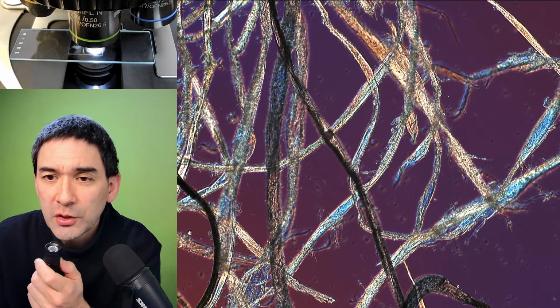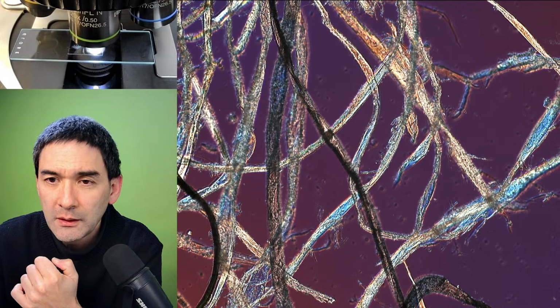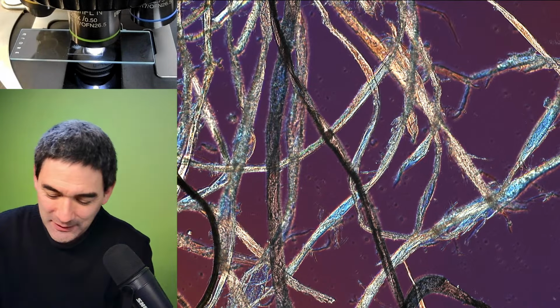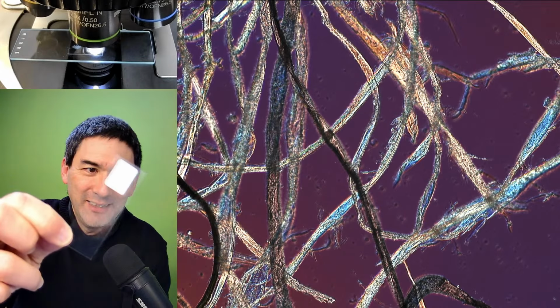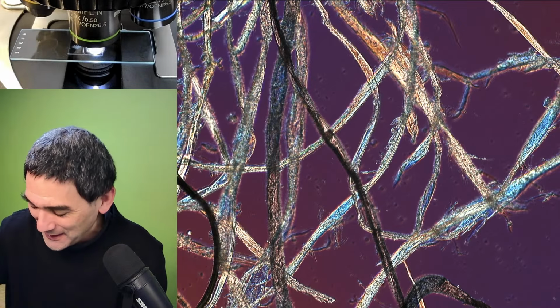There was a question about a microscope camera. Did we note what mounting medium on those slides? No, I did not write it down. At that time I didn't write it down. I didn't even know that there were different types of mounting media available. Why did it switch this off now?